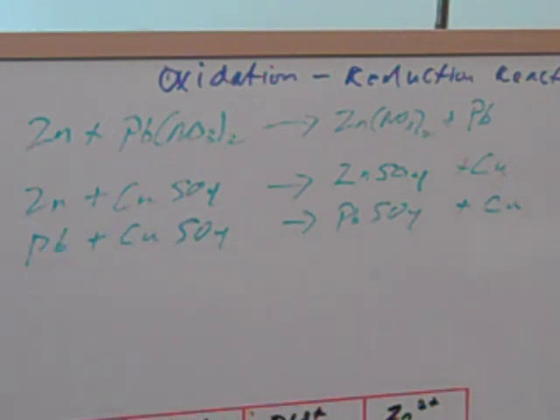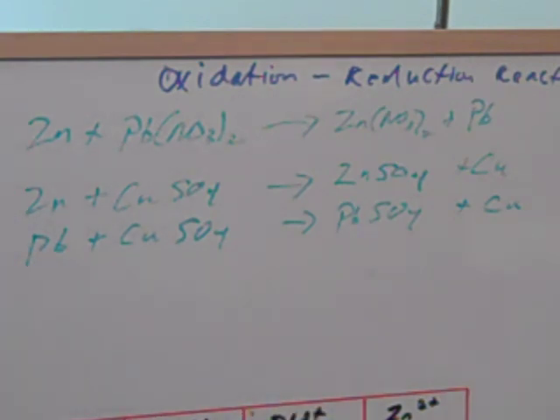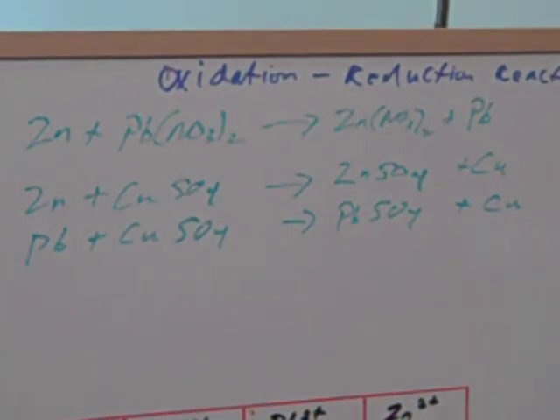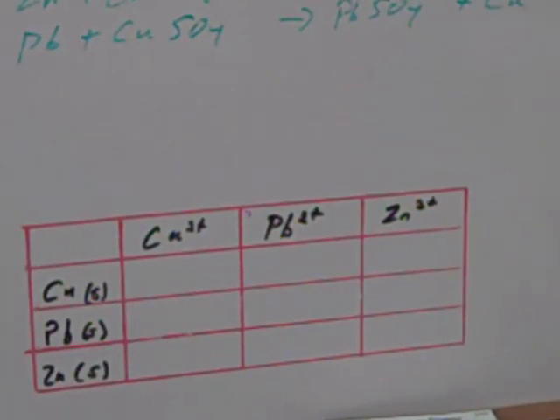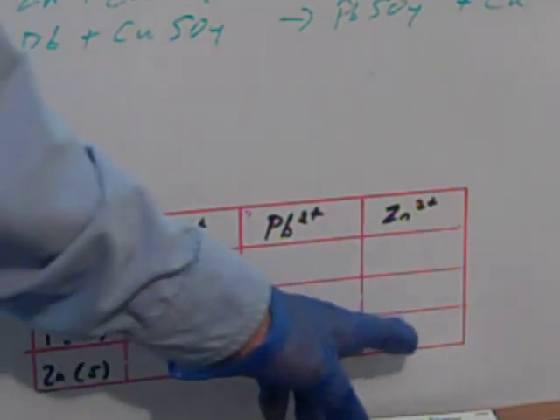Okay, we have three solutions, the copper sulfate, lead nitrate, and zinc chloride. And we're going to add 3 milliliters of each. I'm sorry, I wanted you to see the table. We're also going to keep track of what happens and put our observations in these rectangles as we go. This will probably help you in your home experiment.